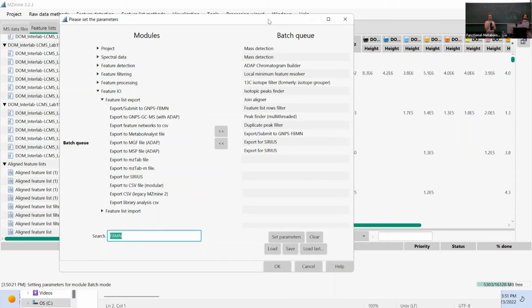So some people might have some problems with the steps, like if some parameters, because it was very fast, right? And there's so many parameters to set up, so maybe you also got some parameters wrong, and then you get way too many features, and it's way too big of a problem. So then you can start fresh from my batch, but also some of the data sets might have higher noise levels, and we didn't really optimize for every data set now.